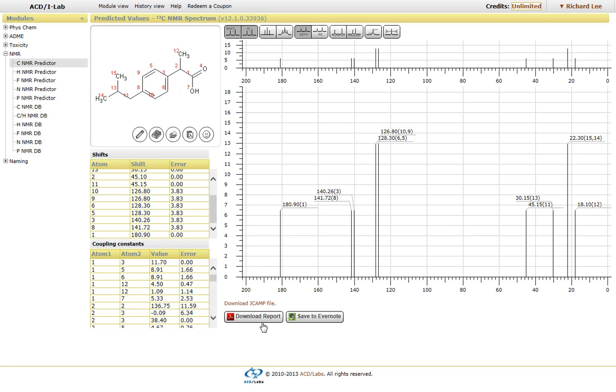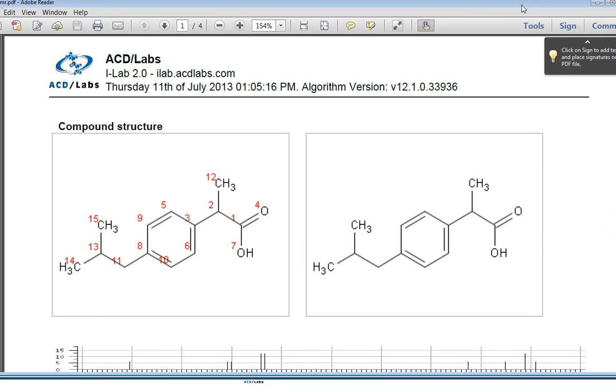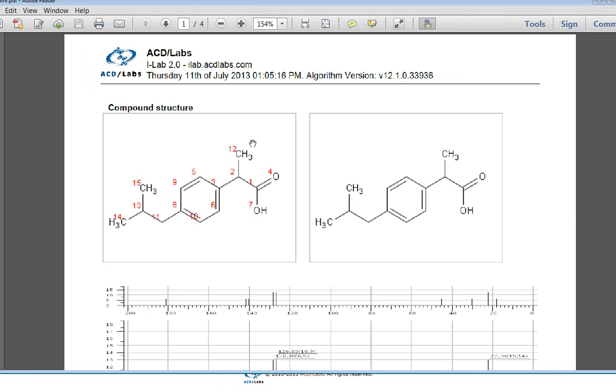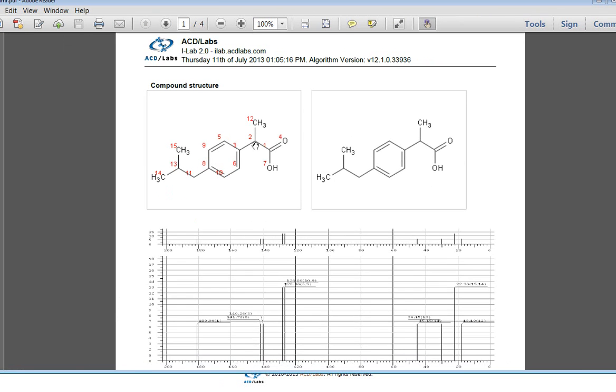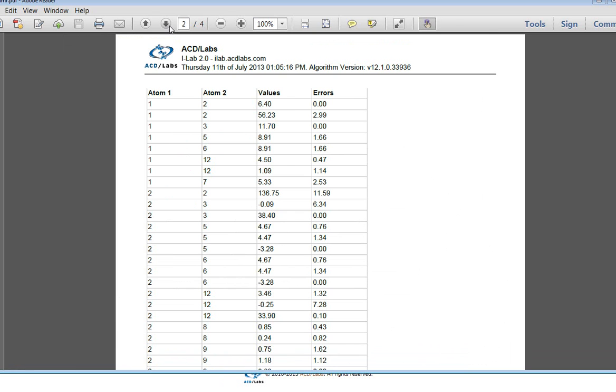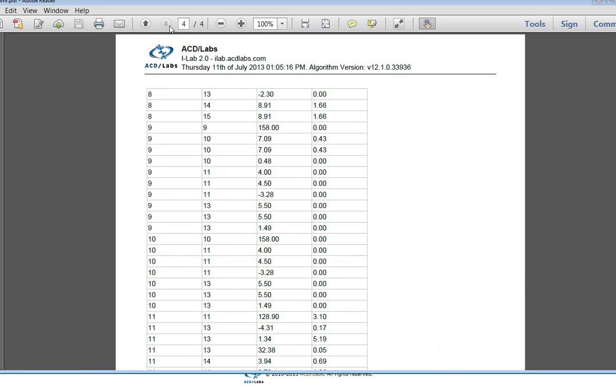By clicking on download report, you'll be able to download either a PDF or Evernote file that has the spectra as well as the tables and structures associated with it. So you have the associated spectrum, as well as the tables and some of the predicted errors associated with the chemical shifts and coupling constants.